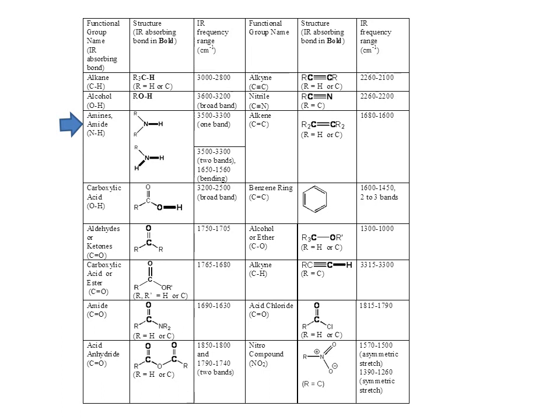And then we also have the bending vibration, where the NHs are doing that scissor-like bend that we saw before, where they're slapping together like two parts of a scissor closing. And that's between 1650 and 1560 wave numbers. In order to confirm that you have an NH2, other than of course there must be a nitrogen in the molecular formula and sufficient hydrogens, you must also show that there are these three infrared peaks in the infrared spectrum. Two bands between 3500 and 3300 wave numbers, and another one between 1650 and 1560 wave numbers.